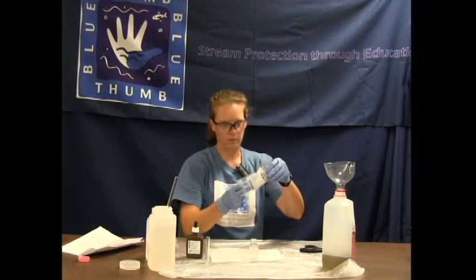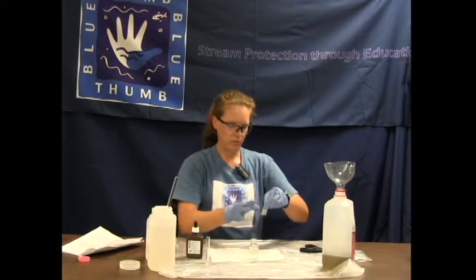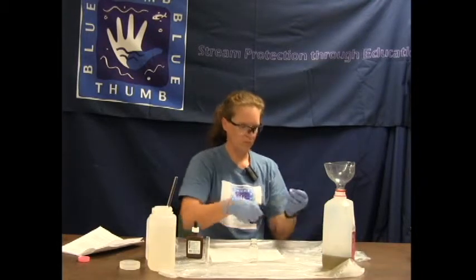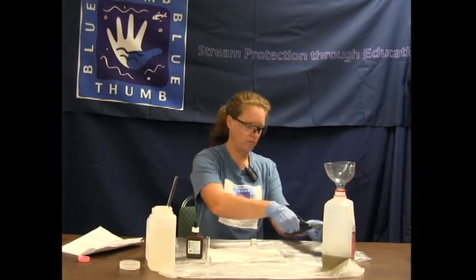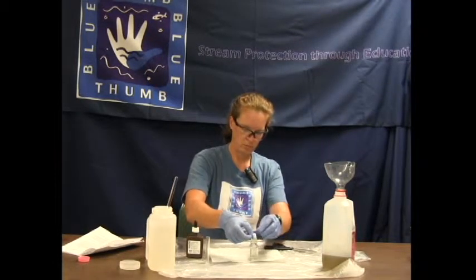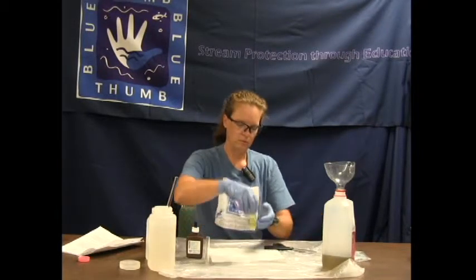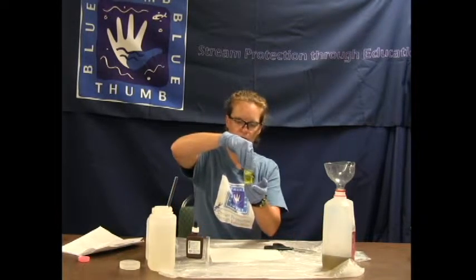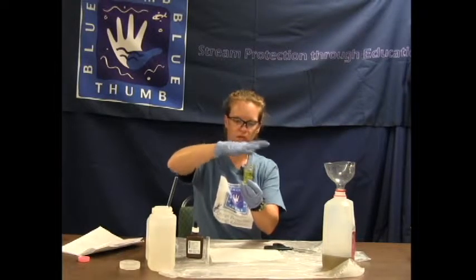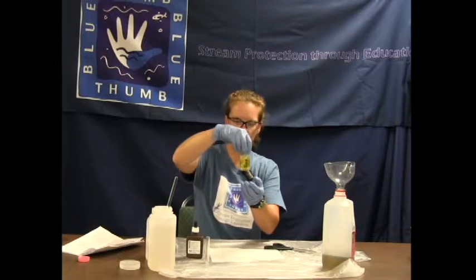Add the chloride powder packet to our sample — cut the top off and add it to the bottle. Swirl and agitate. Don't ever put your thumb, hand, or fingers over the top of the bottle. Just swirl and agitate until the powder is dissolved.